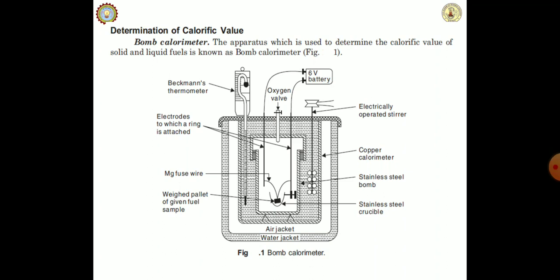That is why corrections are required to calculate the calorific value of the fuel.